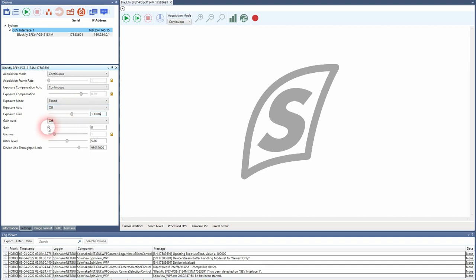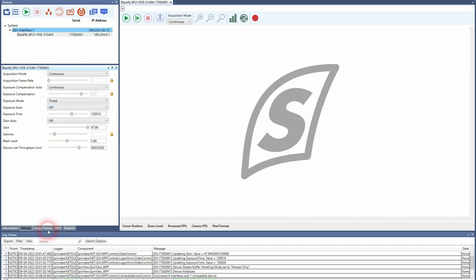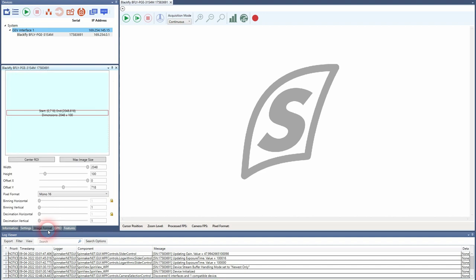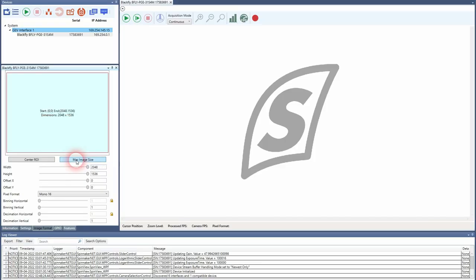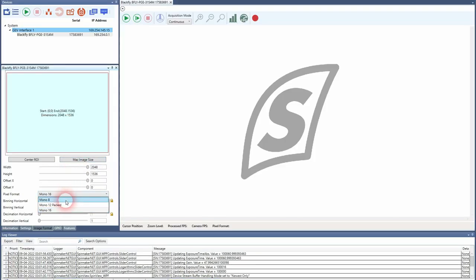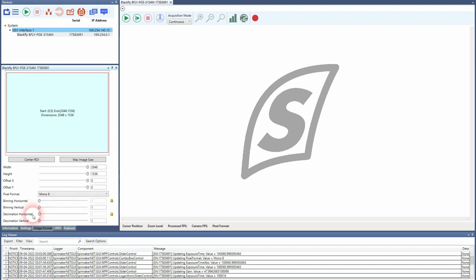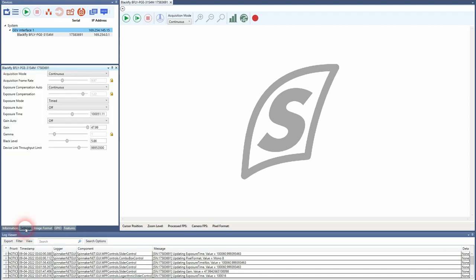And I will put the gain to the maximum. Also I will check in the image format. If you are not using the whole sensor at the moment, click on max image size and mono 8 for 8 bits of signal.